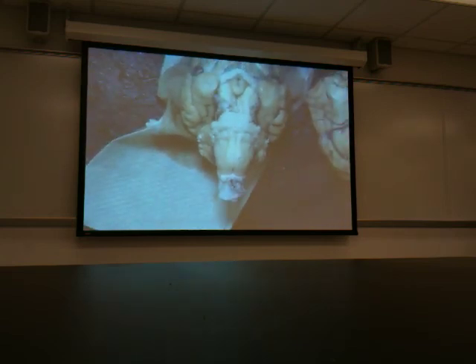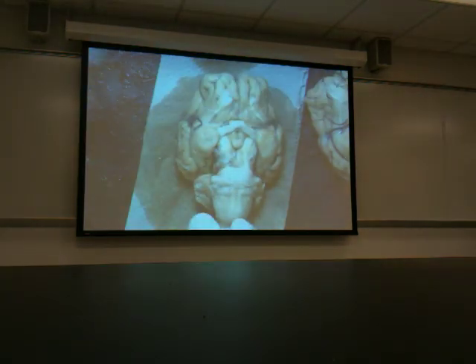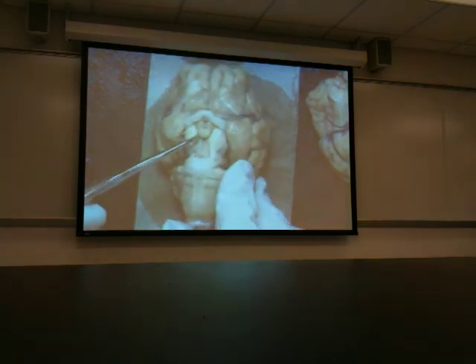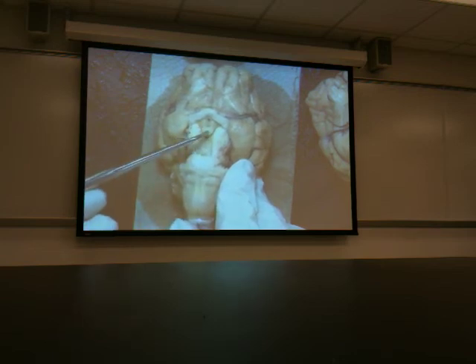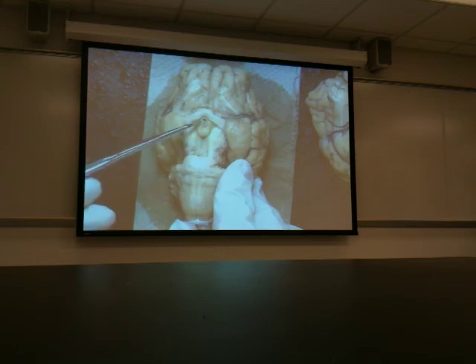All right, on this one, you can see really well. The mammillary bodies are here. Again, it's because the arachnoid is peeled off. This is so obvious. It doesn't look split. Now, you would see in a human brain that truly it is split and looks like breasts. But the fact is that here it doesn't. It doesn't look divided. But this is the mammillary bodies. And I should say these are, but this whole area right here. This is the tuber cinereum, right here.